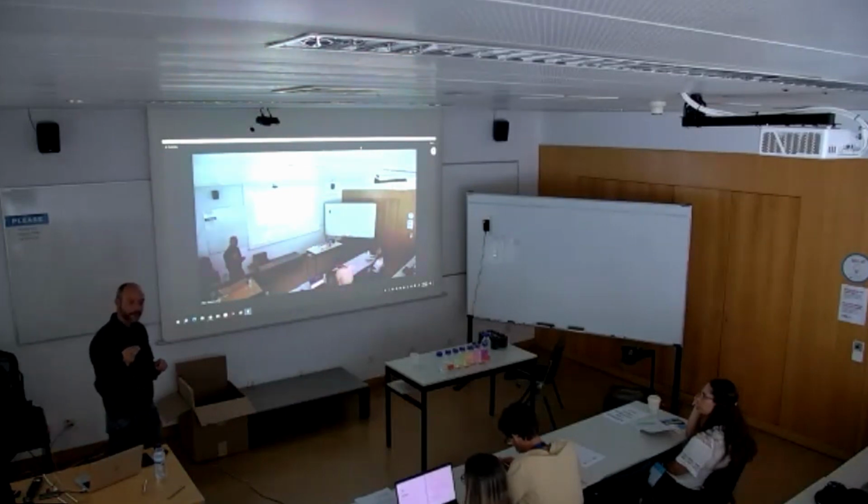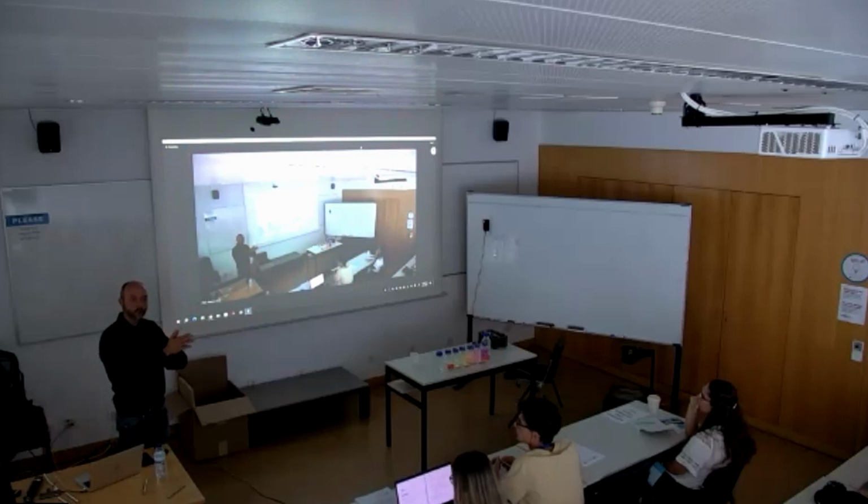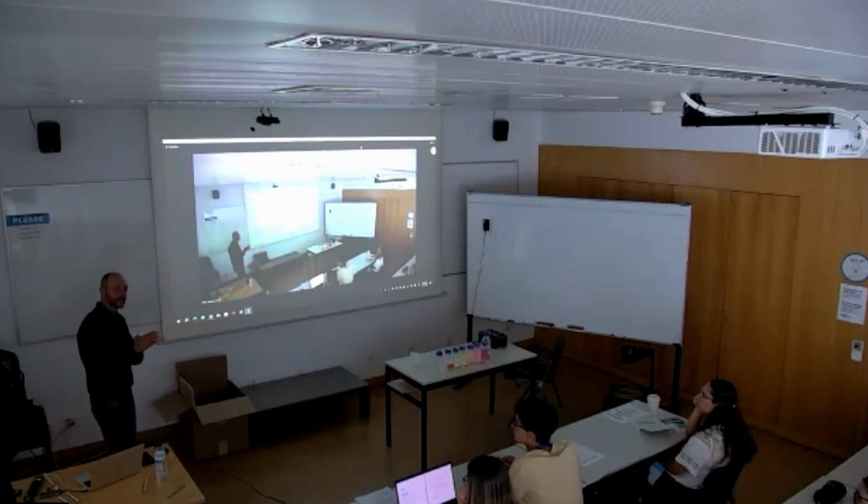When you have interference, you have a portion of light that is the image. So you have the interference factor that is darkness and brightness. And to observe the features of your specimen, you need darkness and brightness. If you have only brightness and there is no interference, you see all white and there is no information there. With interference, you instead build up the actual information.